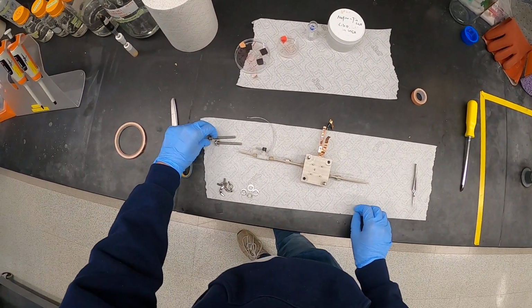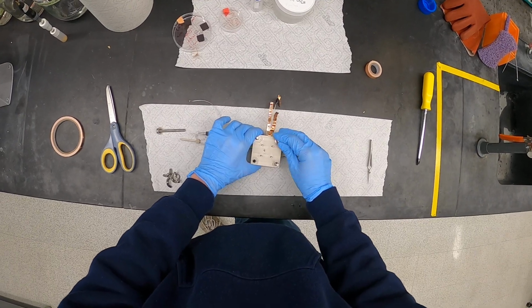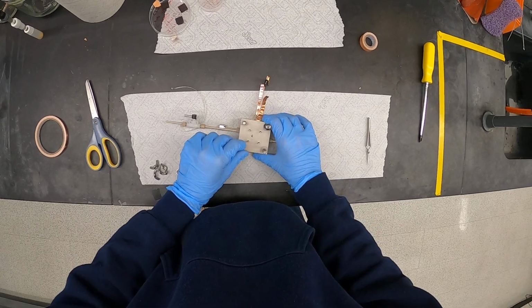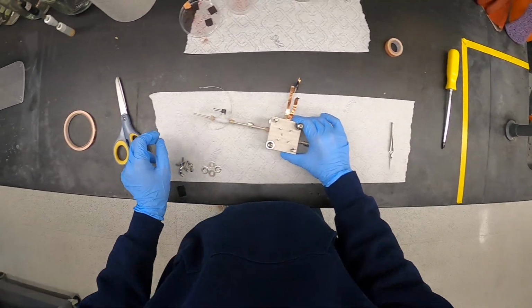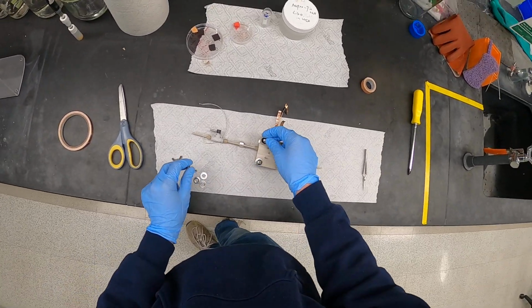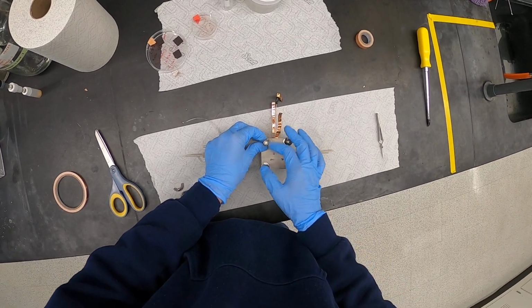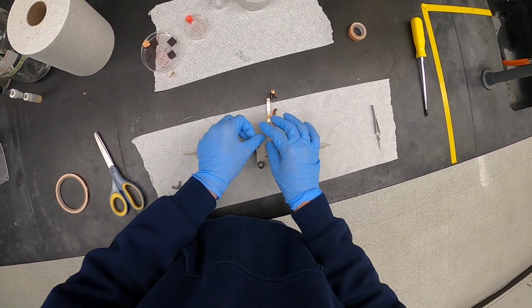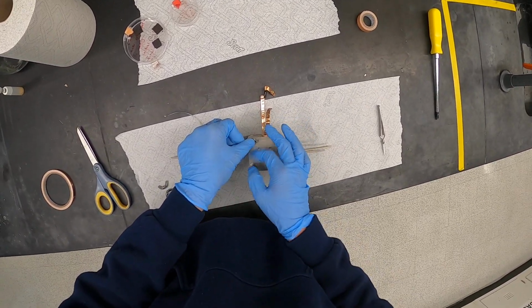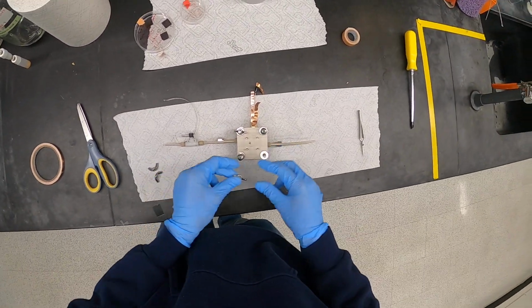Now what we'll do is put the other 2 screws in, the other 2 big screws. Sort of spin it until it goes in nicely, and the other one there. Okay, and now we have these 4 wing nuts that we need to put on. So I'll put these 2 on first on this side, and then I'll hand tighten up as much as I can. Sometimes it's a little difficult, it gets stuck. Hand tight. And then the other wing nut.